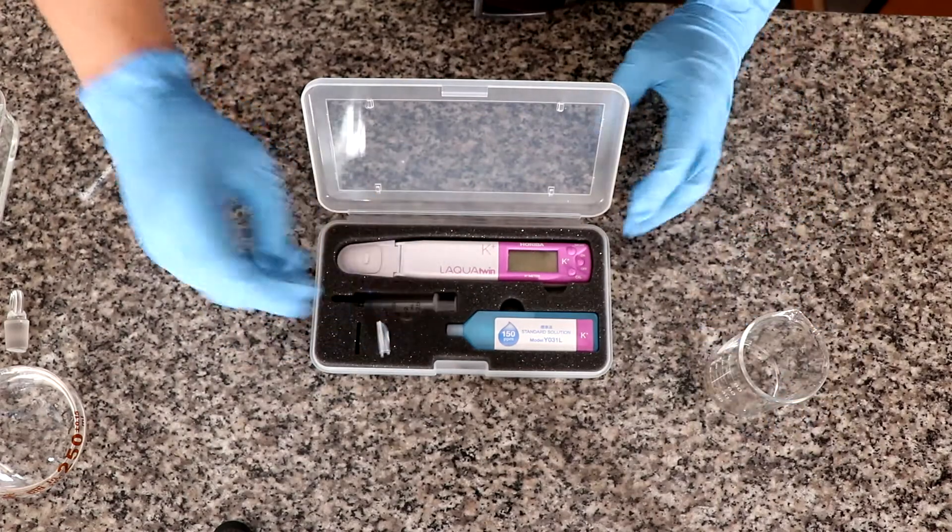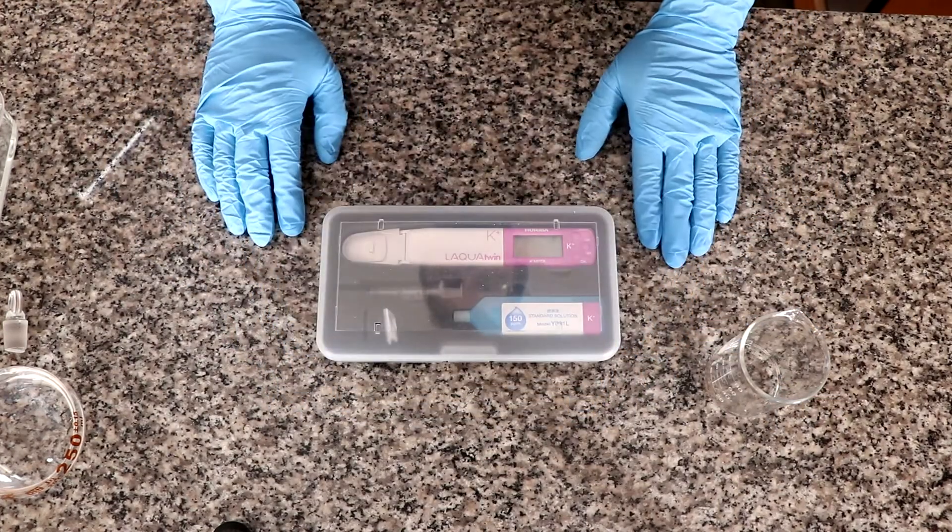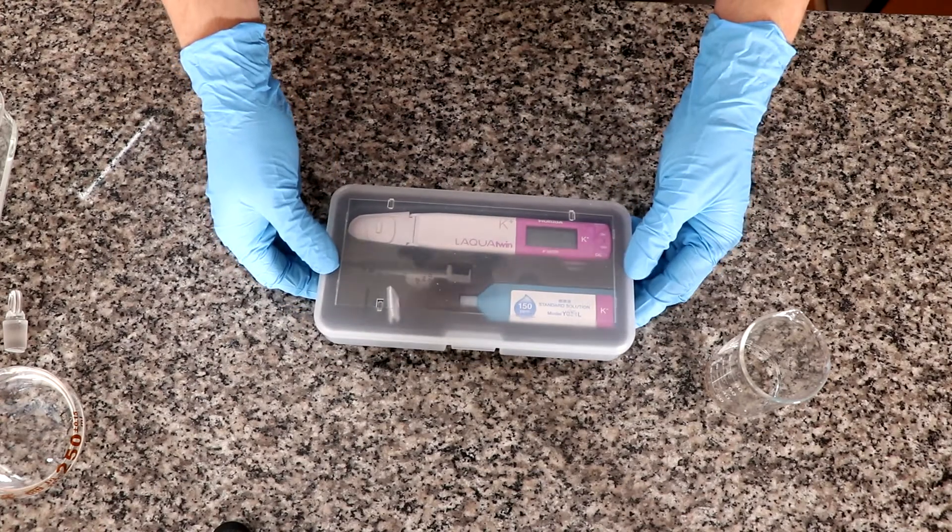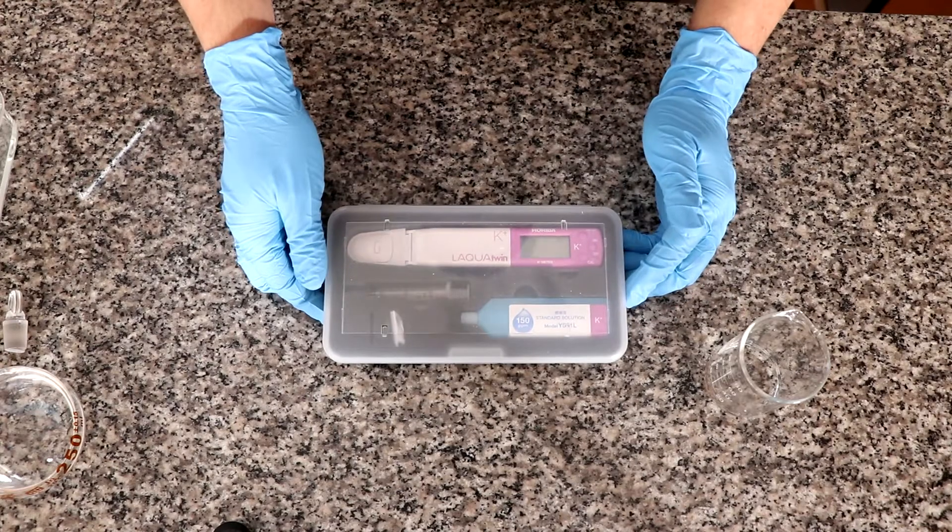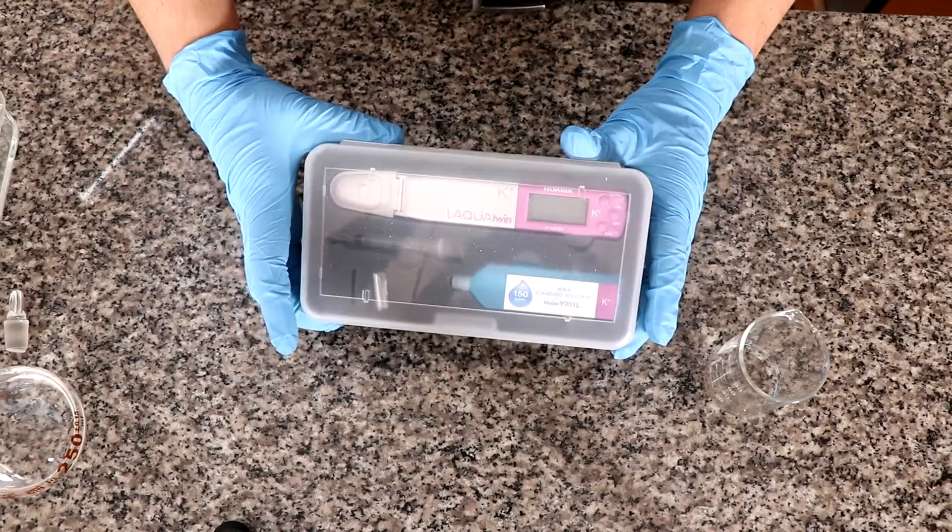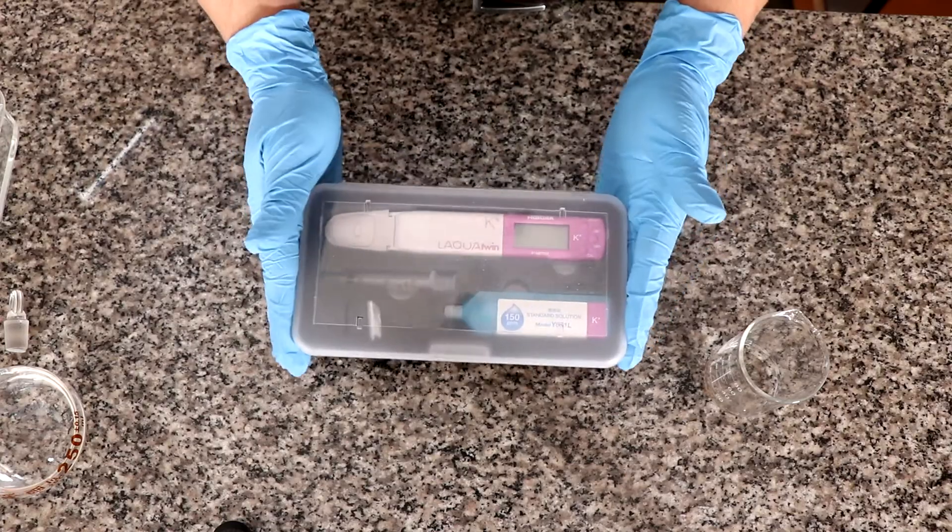So I just purged it with distilled water, put it here, and there we go. So now you will store the electrode like this. You really will not need the box for anything except to keep the manuals. But this is very portable and it's a very neat way to carry them.